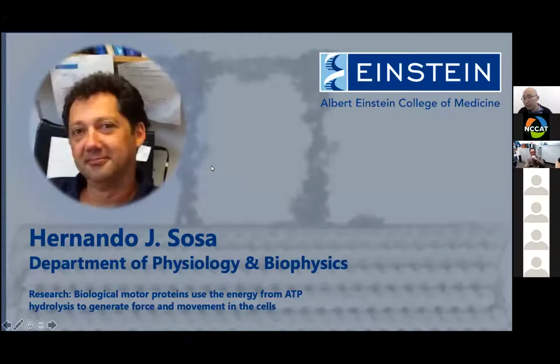Okay, let's get into today's topic. Today we are wrapping up our EM crystallography section. Our guest lecturer of the day is Hernando Sosa from Albert Einstein College of Medicine. He has done quite a bit in cryo-EM and used helical reconstruction in his research. Something quite amazing is that he has a dozen and a half structures of one particular energy cycle. That's an amazing tour de force of showing how you can really uncover mechanism. It also shows how some fields are so mature that you need quite a wealth of information to understand that field.